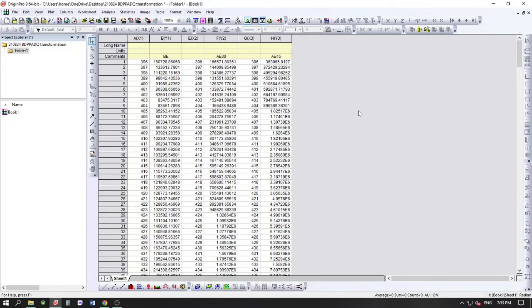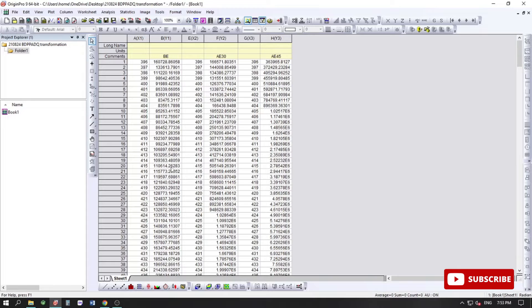Hello everyone, my name is Jitesh. Today I am going to show you how to plot fluorescence spectra and how to make that graph presentable for your thesis. I'll also show you how to normalize them with two different methods — one using the software and one manually.